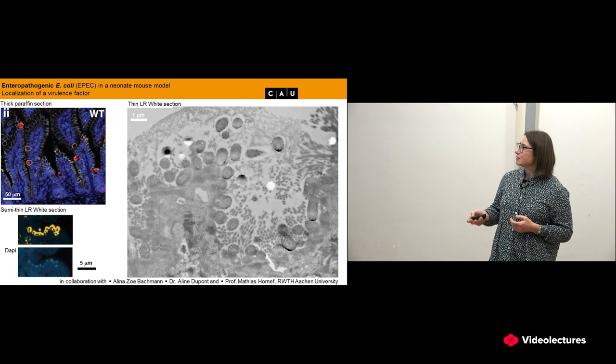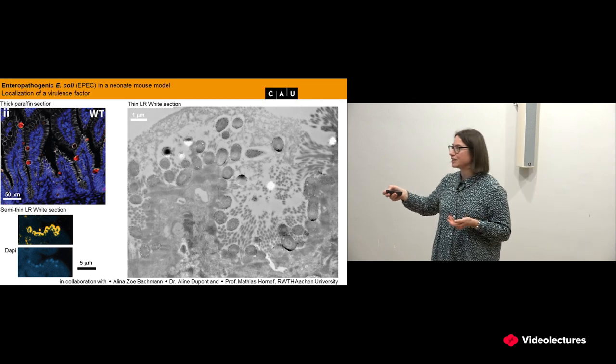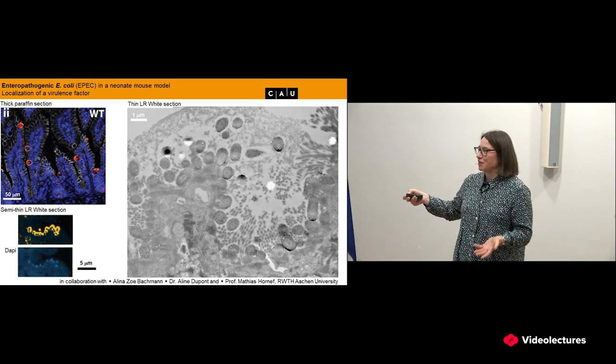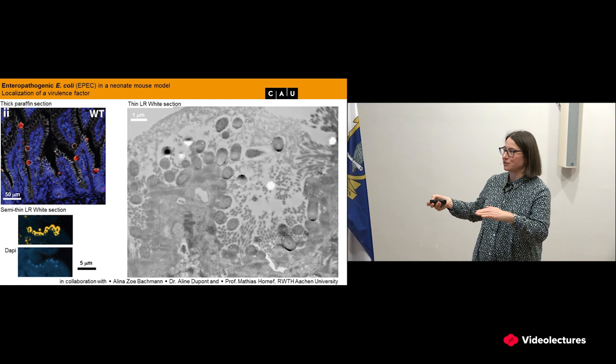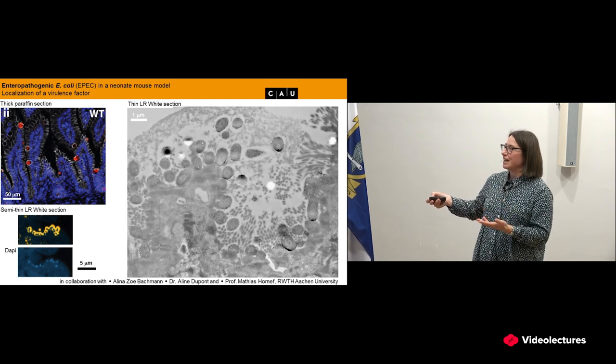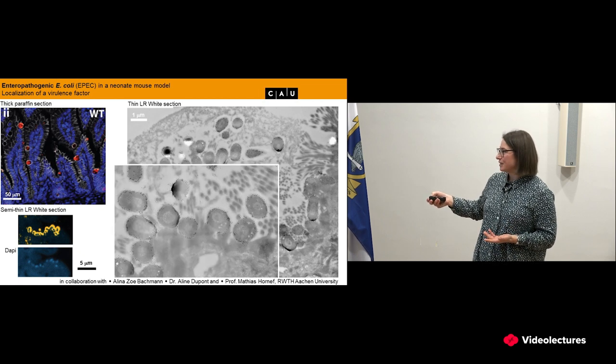These are the bacteria that I've seen before, the EPEC, enteropathogenic E. coli. When the group counts the colonies routinely, they do labeling on paraffin sections, and they just see blobs, right? Nothing else. But when I do the section and label for fluorescence, already with DAPI, I see individual dots. These are bacteria profiles. And this is, again, another level when I do this with immunogold. This is just antigen on the surface. You can see it is labeled also on the side where the bacterium is attached to the cell, which is something you cannot resolve here.